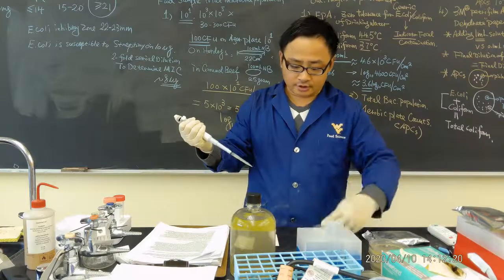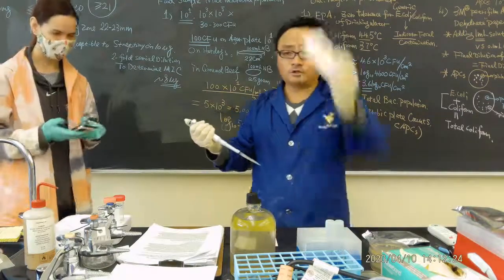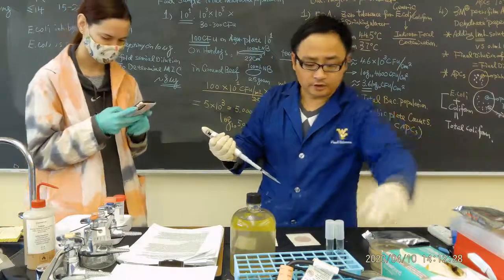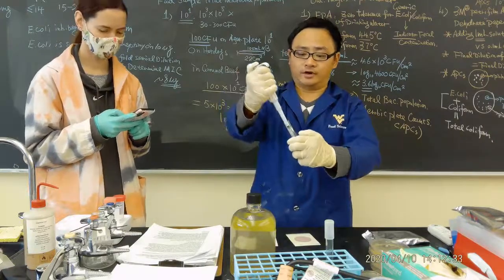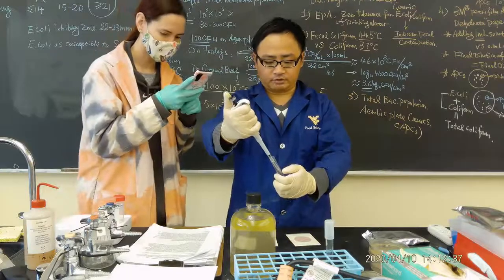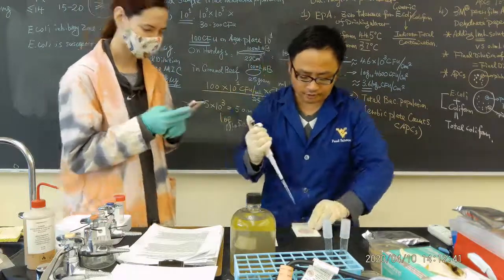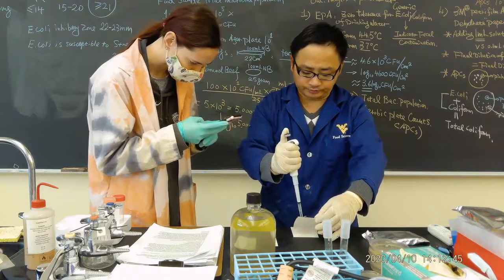So, Karen, can you come here to just take a picture? Yeah. So let me show you how to do it. If we use a Petrifilm, after serial dilution, you're going to add 1 ml. So you take that one, using 1 ml, and we gently add it into the circle.